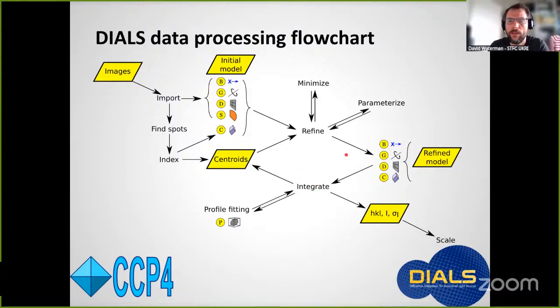integration. And that's different to, for example, XDS, which operates using a sort of moving window that goes through the data set, refining a little block and then integrating and then moving to the next block. The idea with DIALS is that we have a global model for what the experiment is prior to going into integration, which allows global modeling of not just one data set, but multiple data sets together, but also enables a high degree of parallelization.